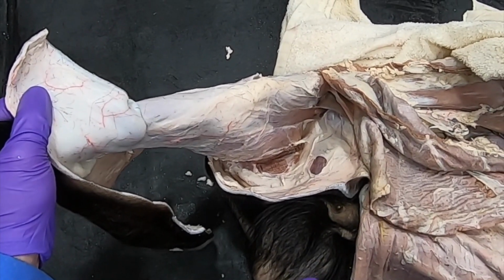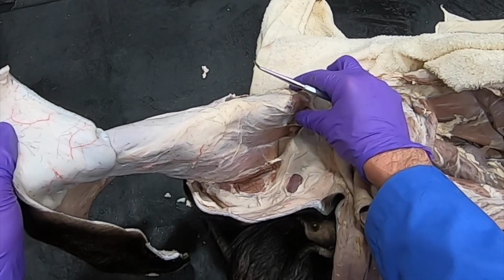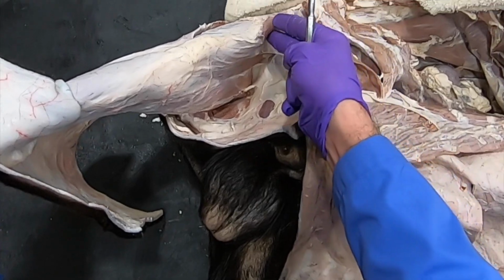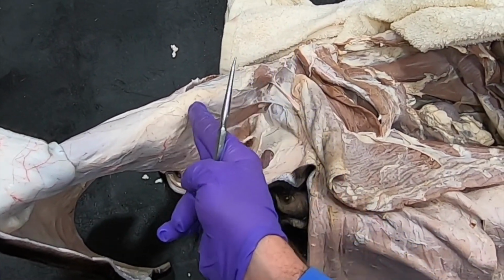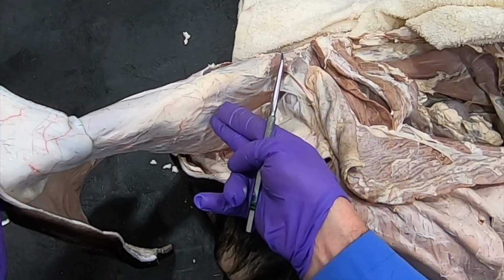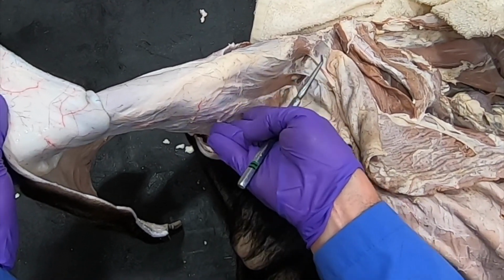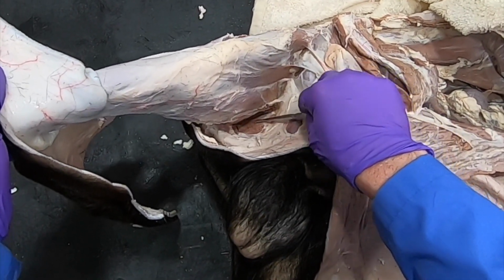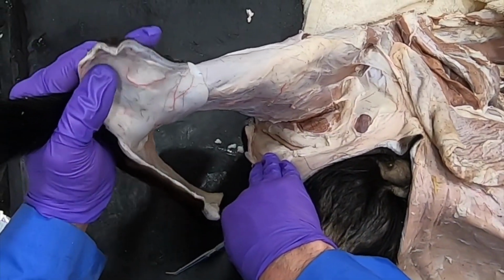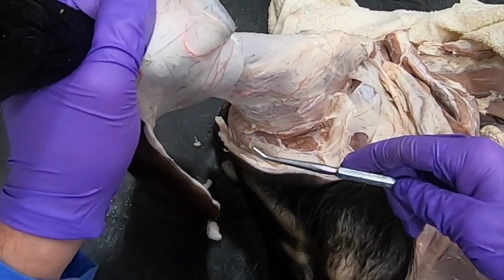So looking on the medial aspect of the thigh, we can see our tensor fascia lata here. It's overlying our quadriceps femoris. We can see our sartorius muscle here, our gracilis muscle here, and then what we've done is cut that gracilis and the adductor down to the pelvic symphysis, and that exposes the root of the penis here. So I just wanted to show you that.